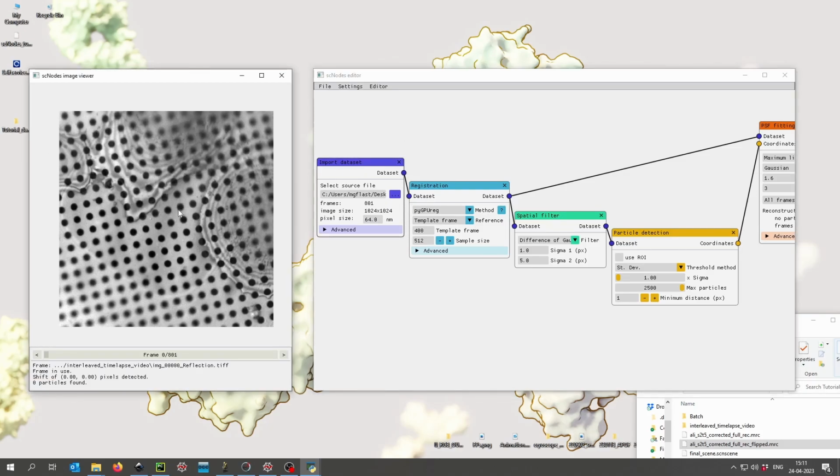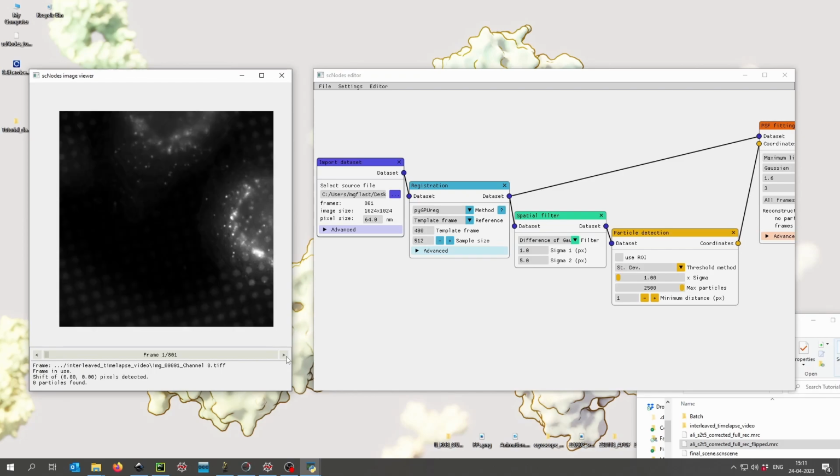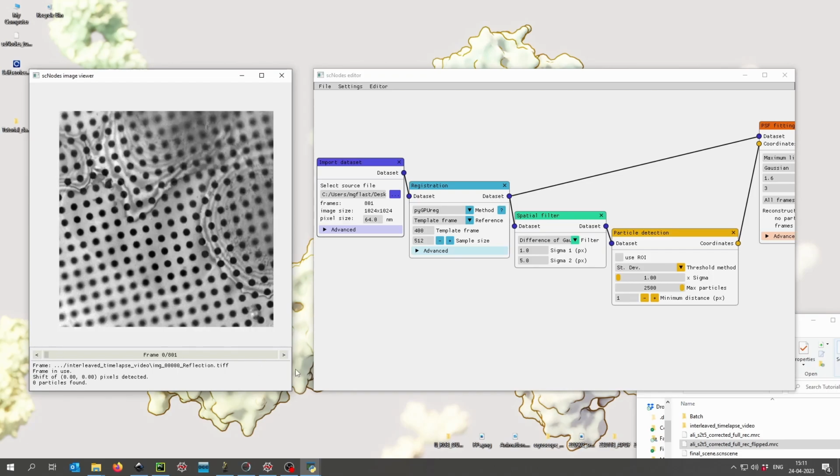We would want to use not this frame, because this is a UV activation image, which we will get rid of later, but this frame, so the first fluorescence frame that was acquired after the reflection image was taken. This is the one that we will want to register all of the other fluorescence frames to, because this one, by acquisition, is internally registered to the reflection image.